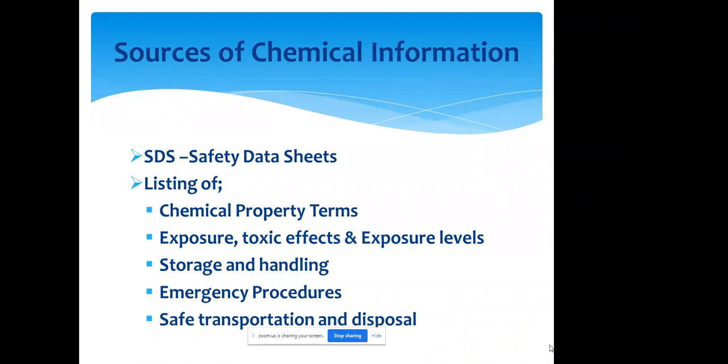So before we go into the clean room portion of it, I'm going to talk a little bit about the general safety part of it, the general chem, for those that have not been into a chemical lab or into any kind of lab that processes chemicals that you might need to know about. First and foremost, if you are going to be working with chemicals, let's say hydrochloric acid and you have never worked with hydrochloric acid before, you need to pull out the safety data sheet.